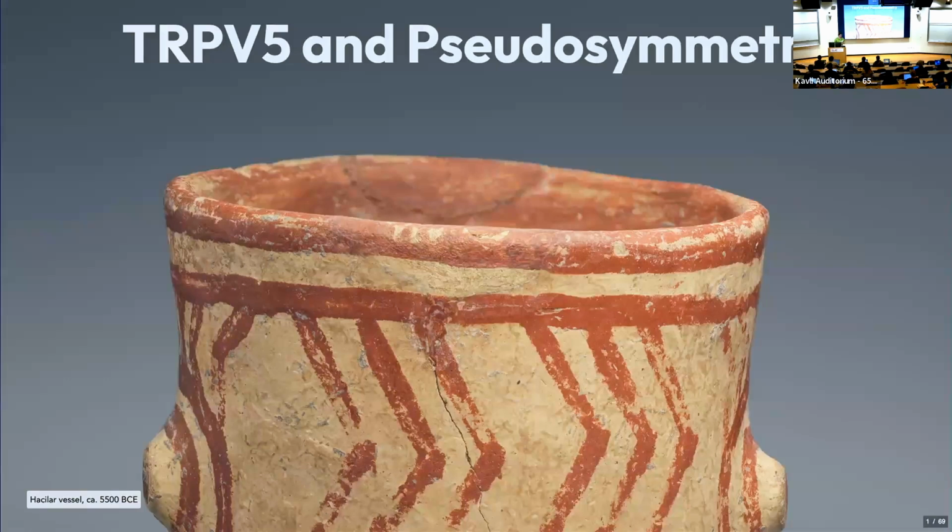So lucky for you, this will be the last of the case studies that I present today, and then we'll have one from Michael on some even more advanced symmetry and non-point group symmetry stuff, as well as some particle subtraction.